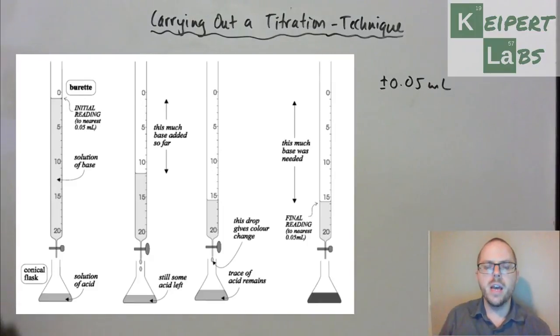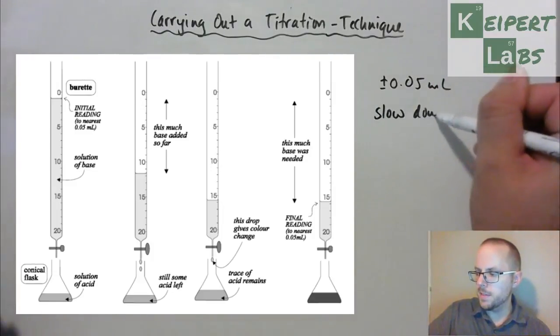So recording that initial value, and then we open up the tap. We dispense some of the base in this case, out of the bottom of the burette, into the flask, we swirl it, and we observe some colour changing going on. Now it hasn't reached the point of the equivalence point, so what we notice is we see a quick colour change that disappears straight away, as the reactant mixture is swirled. And then as we get closer and closer, as we've dispensed more and more, what we do is we slow down our dispensing.